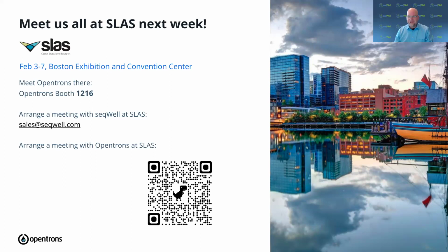The first one I see, and I think this is more of a question for you, Kinnari, is can you pool the samples into one tube on the Opentrons Flex platform? Yes. We used our higher volume single channel pipette for the pooling steps here. So yes, it's really feasible for us to do on the Flex for this particular experiment. We used that P1000 single channel pipette.